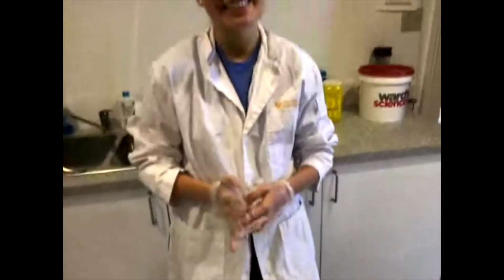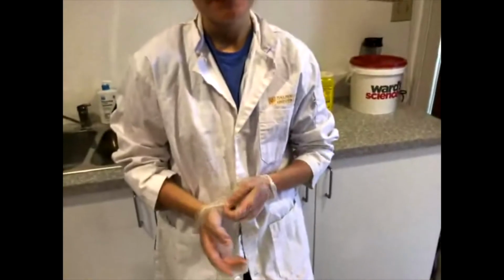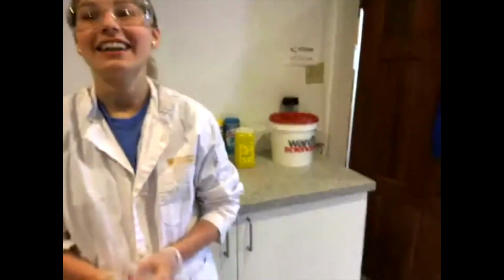See if there's any more. Can squids come in different colors? Yes, they can come in different colors. Some of them are more white and some of them are more gray. This one's really brown, and then again, they can change colors with those chromatophores.